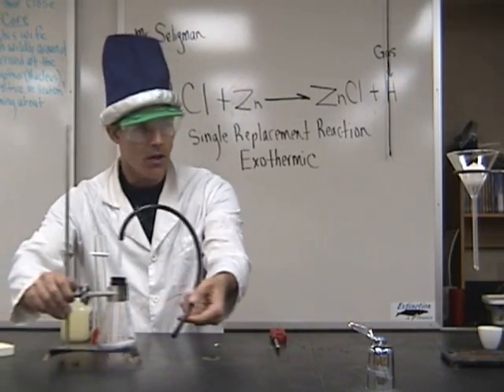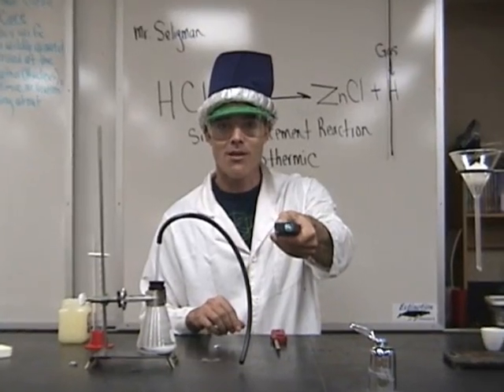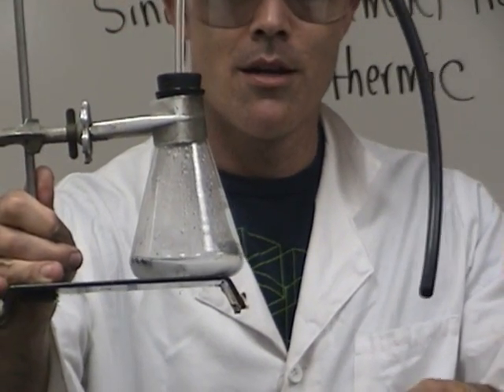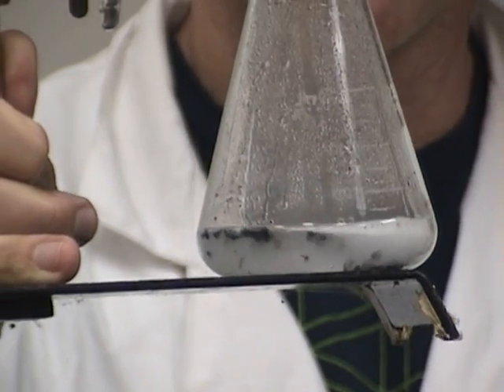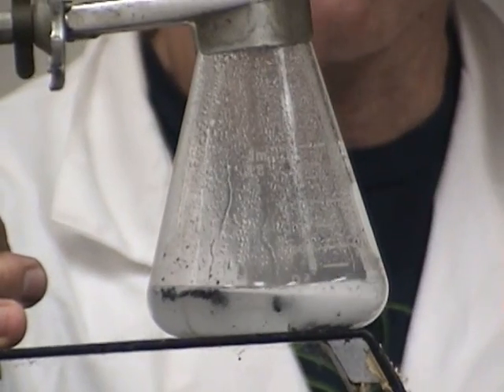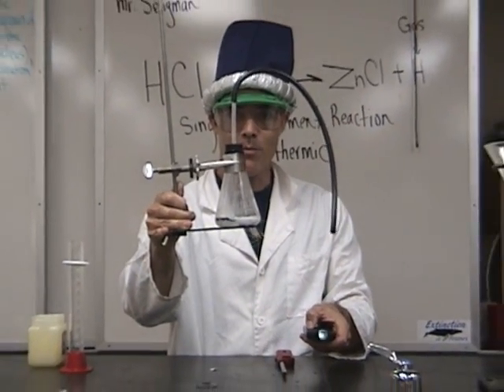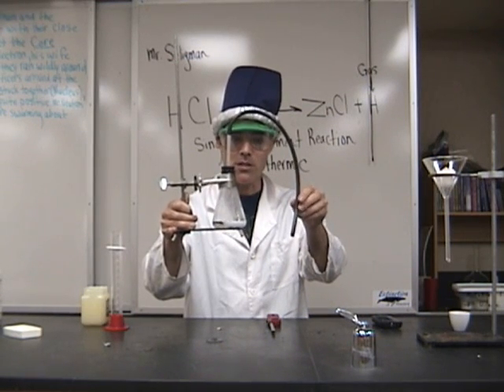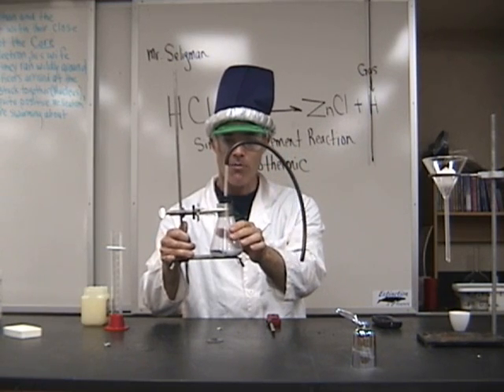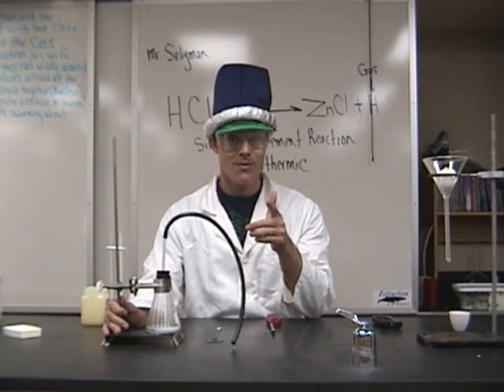I'm going to bring you a little bit closer to show you what's actually going on inside this Erlenmeyer flask. There's still some bubbling going on and it's quite hot to the touch. Most of the zinc I put inside has now changed considerably — it doesn't look anything like it did when I put it in. There's still a tremendous amount of heat on this rubber tube and the Erlenmeyer flask is very, very hot. This is still quite reactive. As I said, this is an exothermic reaction — which is the opposite of an endothermic reaction.